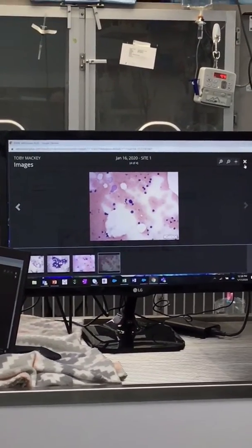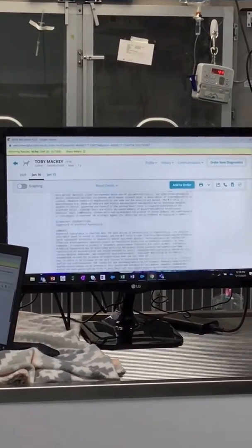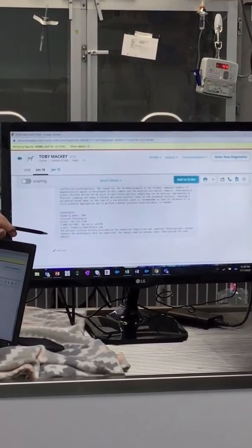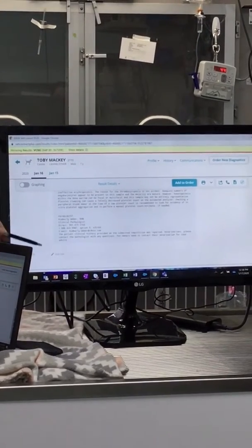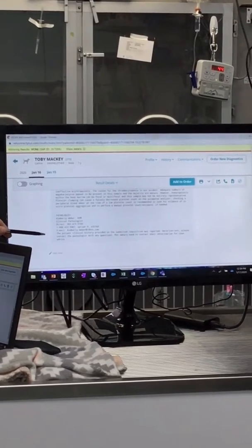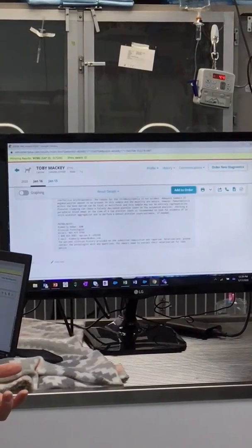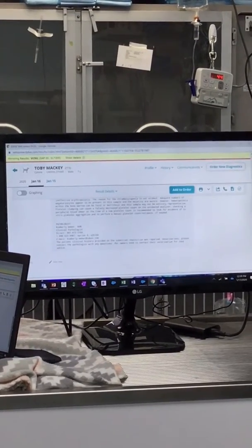And don't forget, I'm sure y'all know this, but I always like to bring this to your attention. What's cool, it's on your report too, but if you scroll all the way down, you actually have who was the pathologist. So let's say you were expecting it to be something else. This would be good to actually, instead of just calling support, call the pathologist and have that conversation. They have the slides, they can pull them out and look at them. So that's super cool. And what's important is the more information you give them, the better their report's going to be, okay? Do you ever, or have you ever sent in cytology slides with a biopsy?